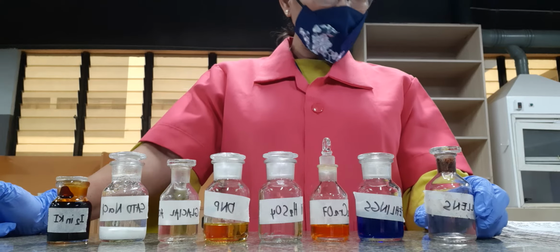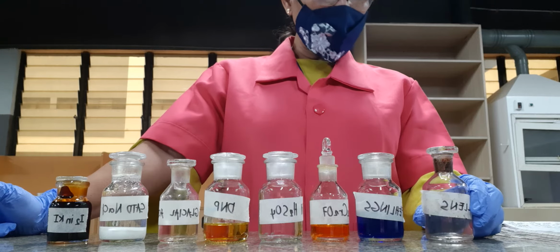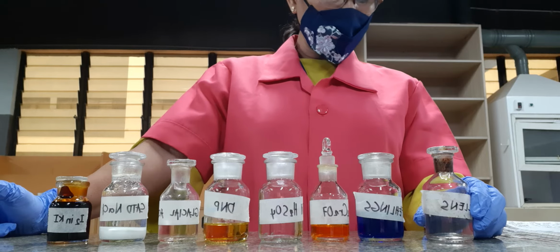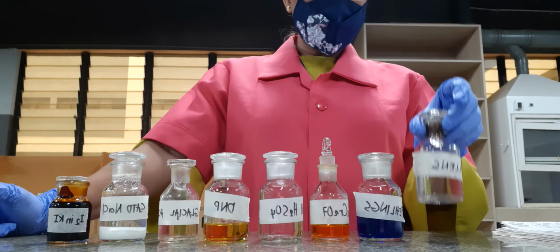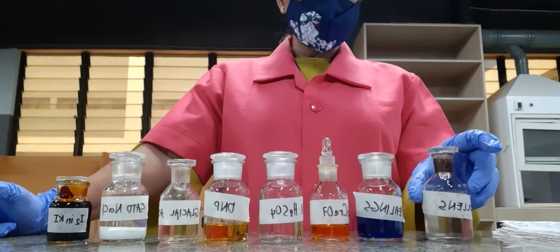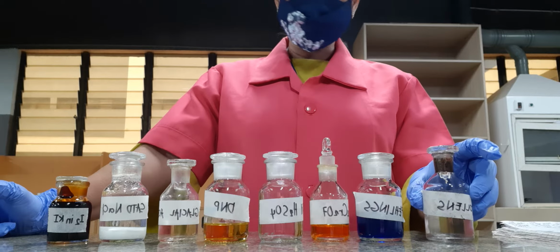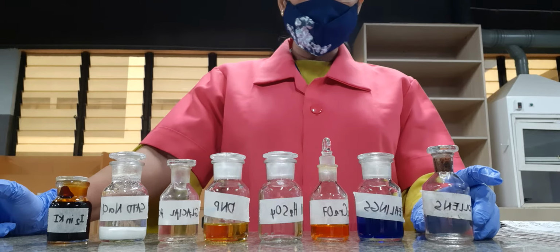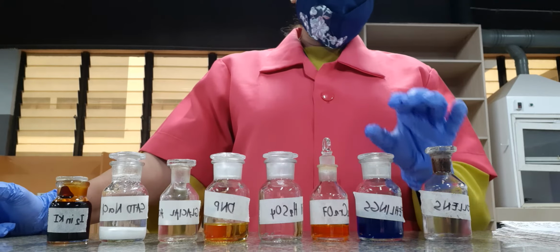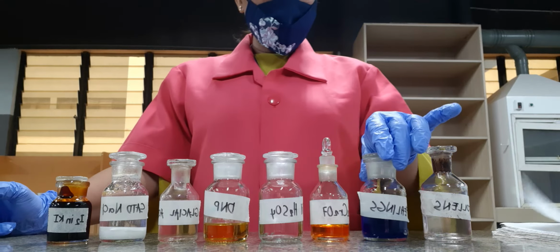Therefore, our oxidized product is the salt of carboxylic acid. Once again, our positive test result is the deposition of metallic silver along the sides of our test tube.